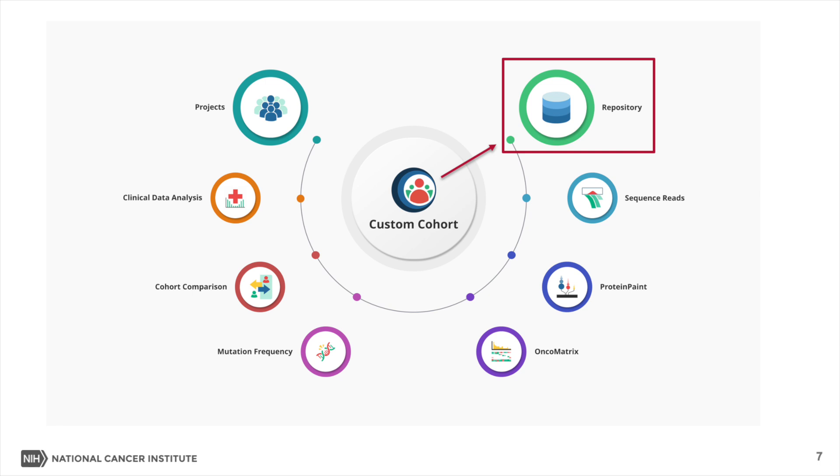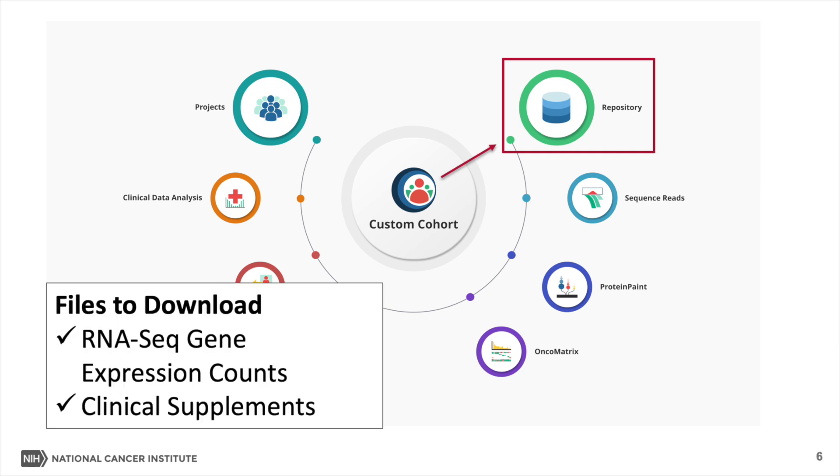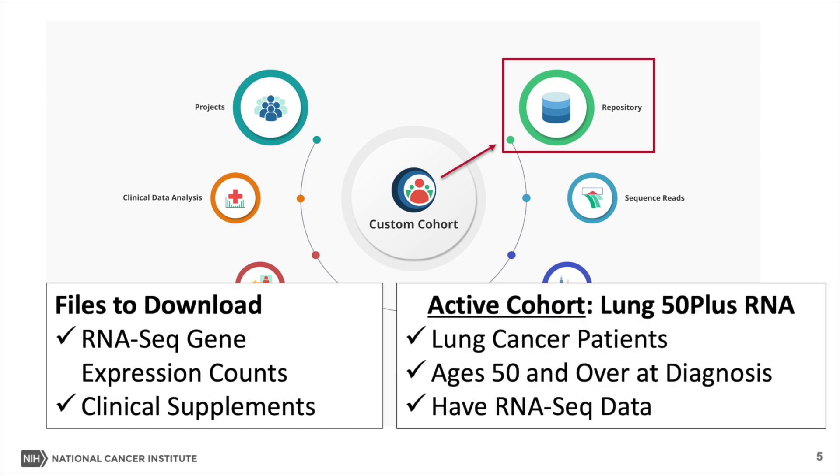The GDC Data Portal 2.0 repository tool allows users to download harmonized data files that are associated with a specific cohort. In this GDC video tutorial, we will download the RNA-seq expression count data, plus the clinical supplements for our active cohort, which was previously created with lung cancer patients who are 50 years of age or older at diagnosis and had associated RNA-seq data. For information on creating a cohort, see the Cohort Builder tutorial video.